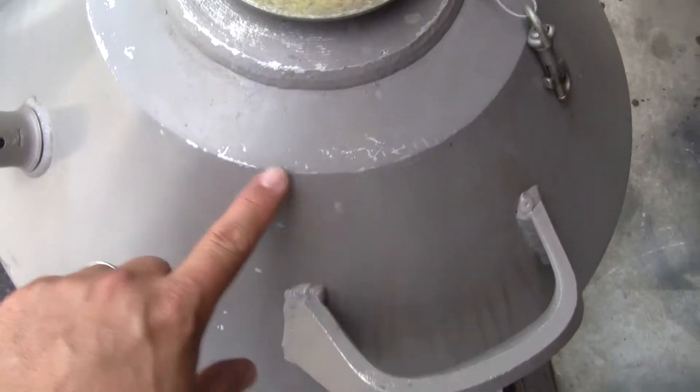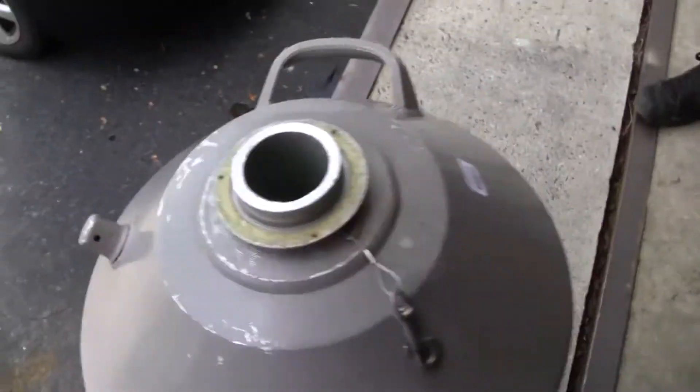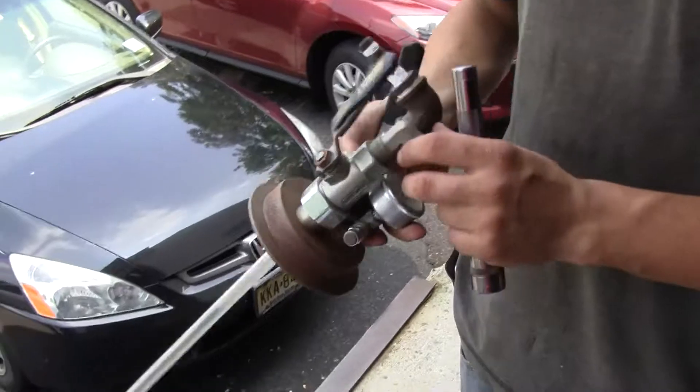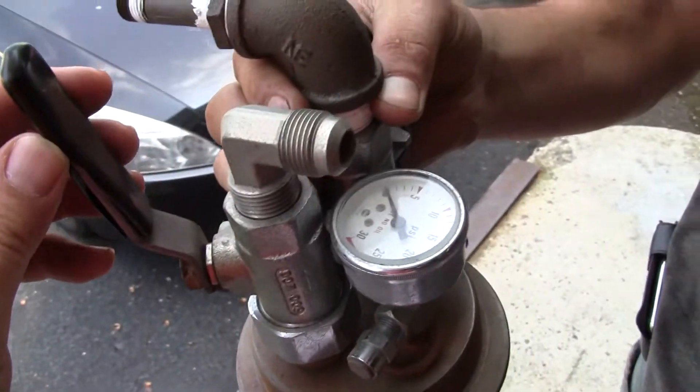Normal wear and tear. Chris is holding the top here, which shows normal oxidation — a normal flask.